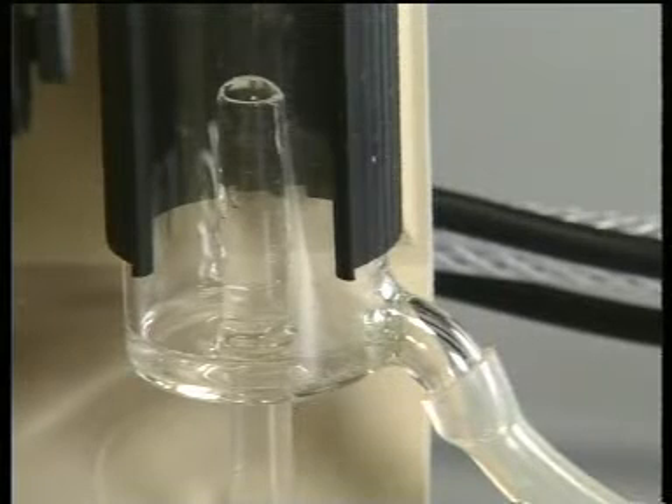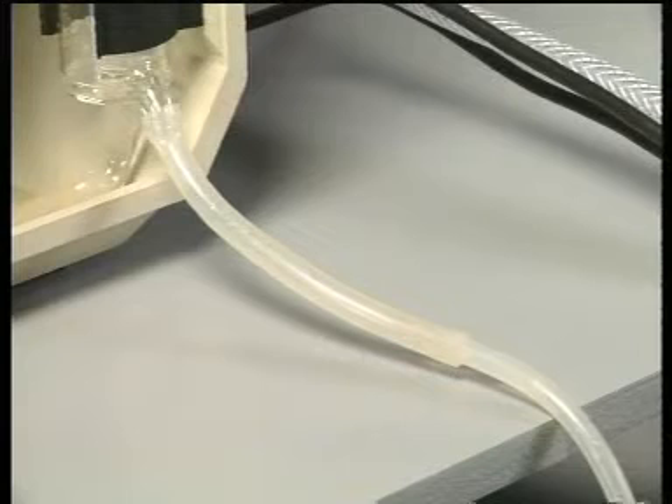Check regularly that the runoff system is functioning correctly. If it is not, the instrument will not give reliable readings.